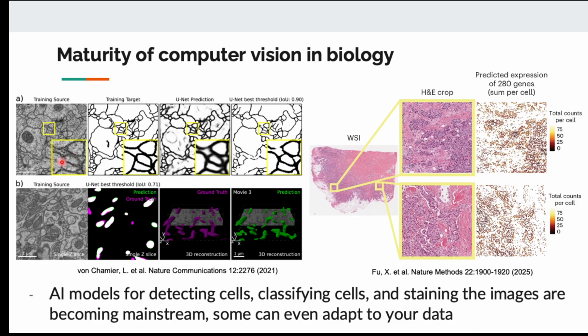So for example, in this case, if you want to identify the fiber structure of the protein or the cell inside the image, you can only see it with phase contrast or brightfield data. But if you want to measure how thick the fibers are, how long the fibers are, you need to be able to recognize which part is fiber and which part is not. And nowadays we have imaging software that can apply a threshold.